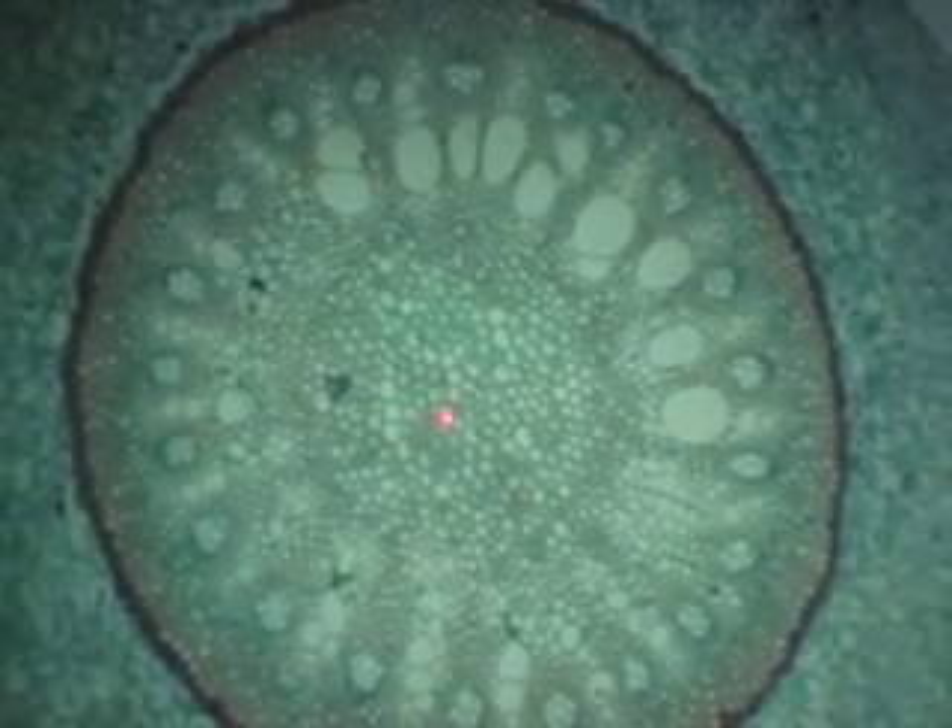Number 4, monocot root. How do you know it's a root? One vascular stele. How do you know it's a monocot? We've got a pith. At higher power, there's the epidermis, a lot of parenchyma, then the endodermis. And then this would be all pericycle here, about four rows. And then that's phloem, and then we have xylem — that's a big xylem vessel. So we've got xylem, phloem, xylem, phloem, xylem — they alternate.